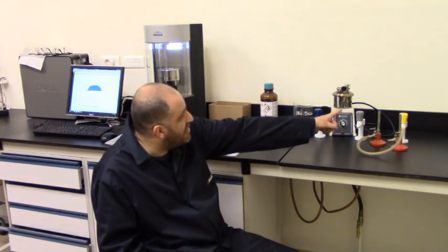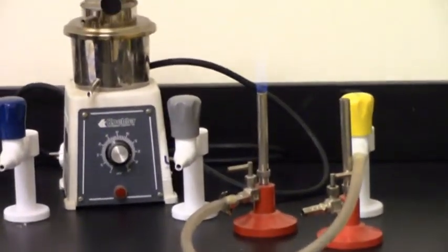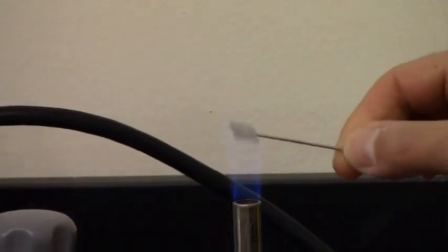Now, this plate will be used in the very first part, which is the surface tension. We will be using it with water to determine its surface tension. The plate has been cleaned with soap, rinsed with distilled water, and then ethanol, alcohol, and then rinsed again. And finally, it will be put into this flame. This last part is not to make it cleaner, it is already clean. The flame is important to make it very active.